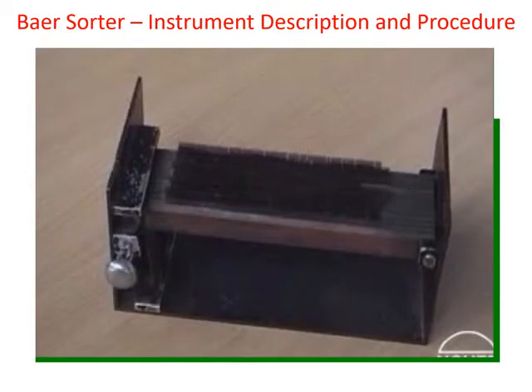The total accessories are not displayed here. You can see the bottom combs. These are the bottom combs. There are 12 bottom combs. One end of the bottom comb is fixed here, and on the other side there is a rack wherein the bottom combs can be dropped one by one. This side is fixed and the other side can be dropped.